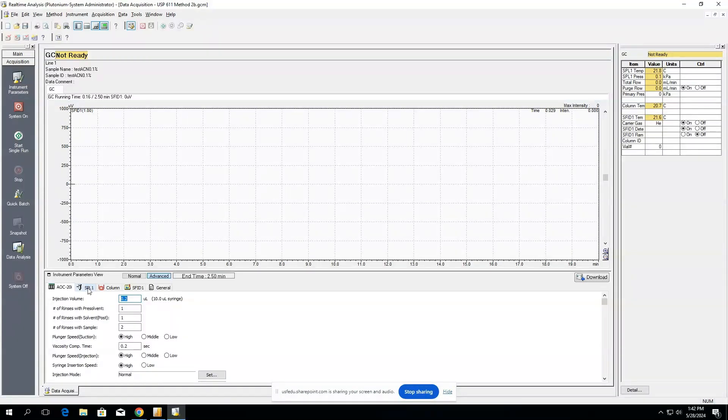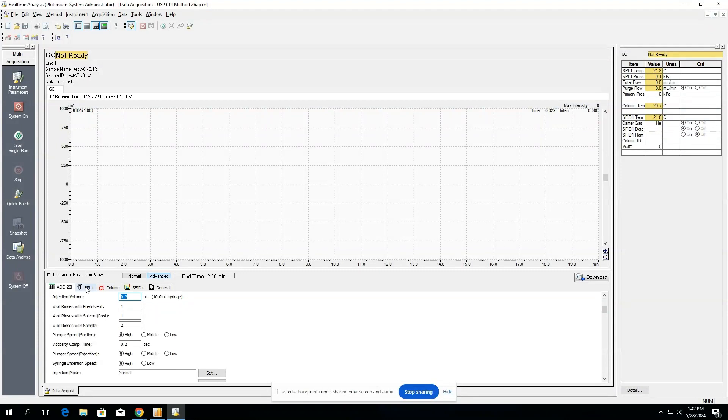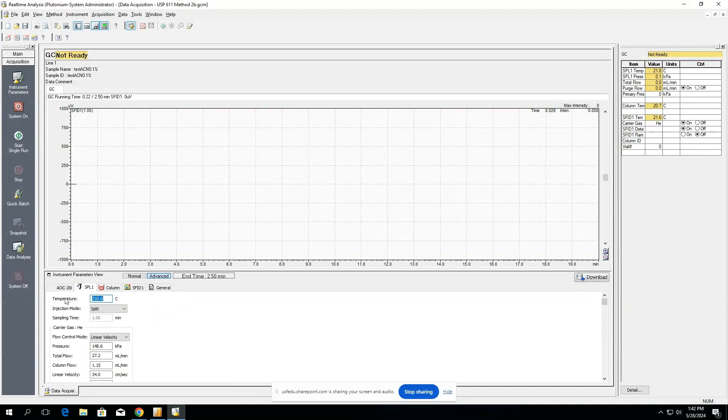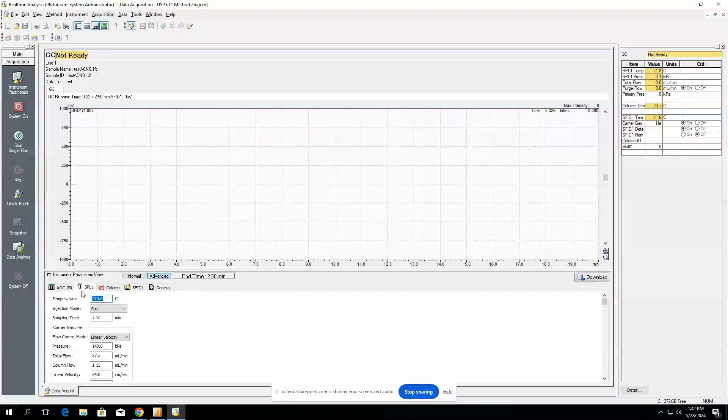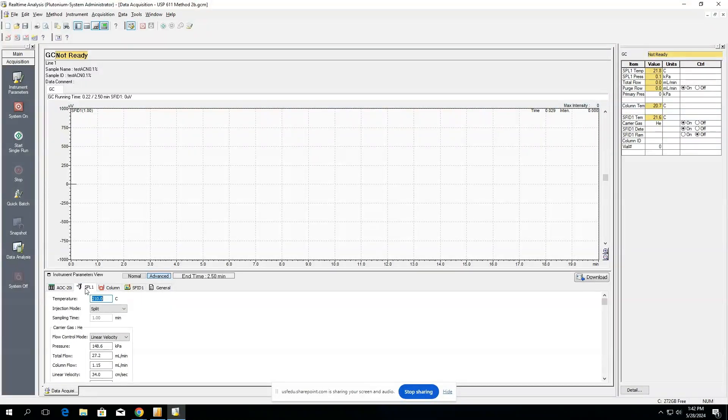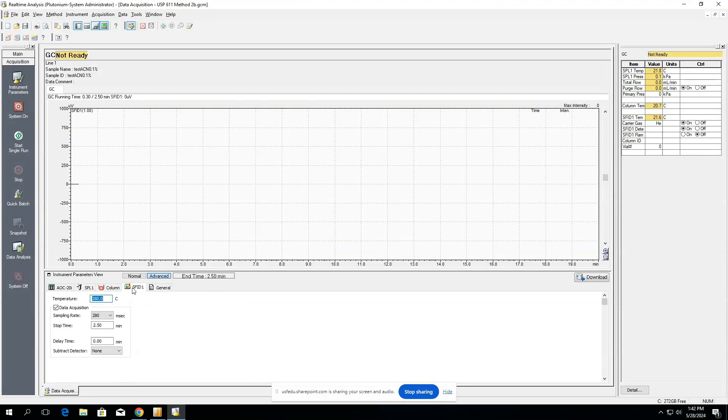We're assuming that you already know all of the parameters for your method, so you can go by. This is going to be your injector, your column, as well as your FID detector.